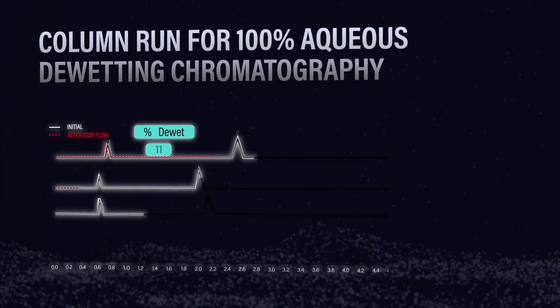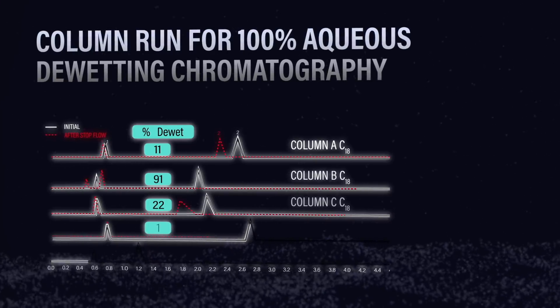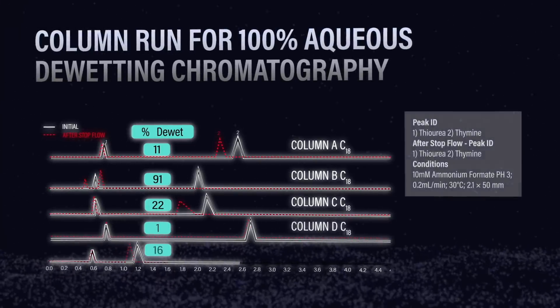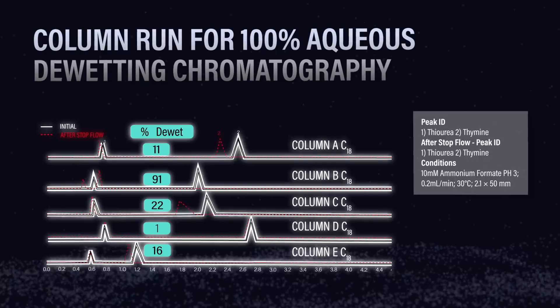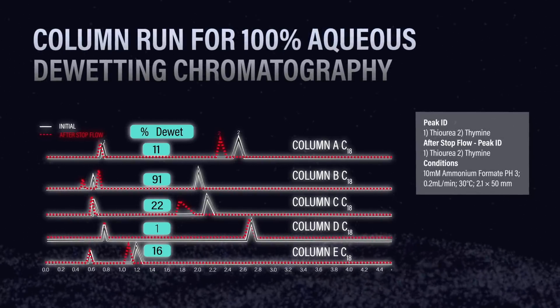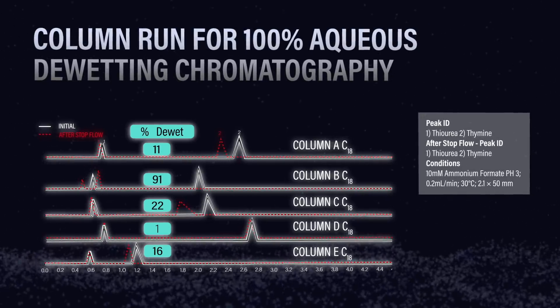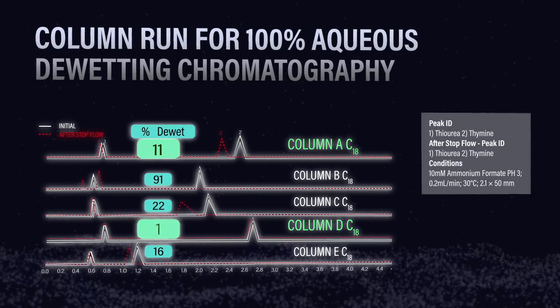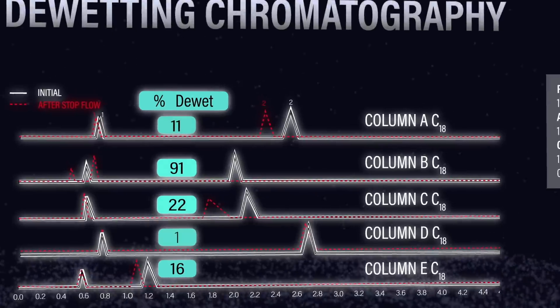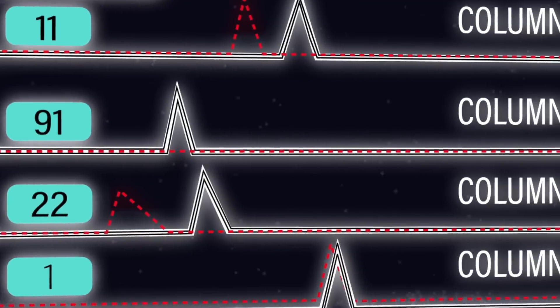Okay, we have some data, let's take a look. So it looks like we ran five columns here, all C18s, and some really interesting results. The black line indicates the initial retention of the phases when they were wetted, and the dotted red line shows how much retention that phase lost in 100% aqueous mobile phase. Some columns didn't really lose any retention, but as you can see, some lost quite a bit — so there's a wide range of overall wettability.